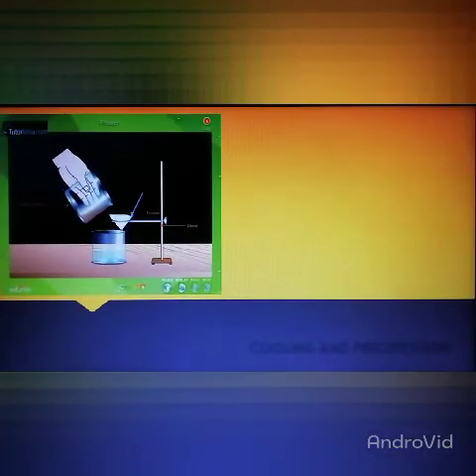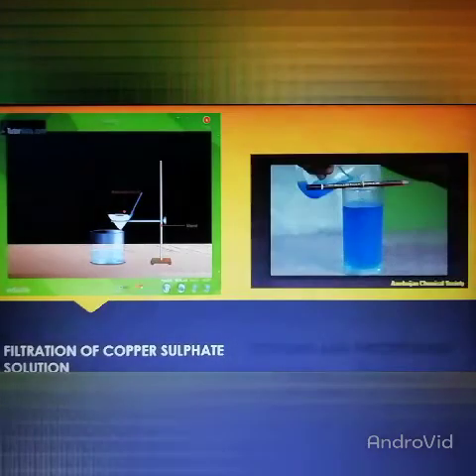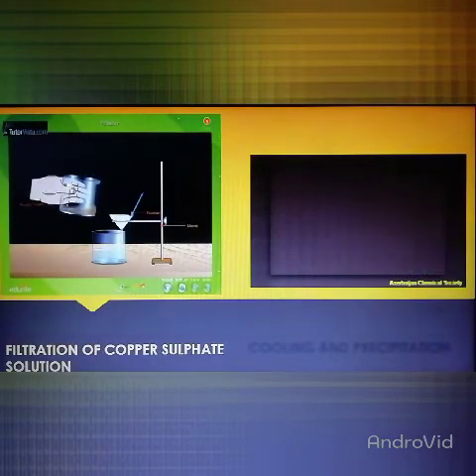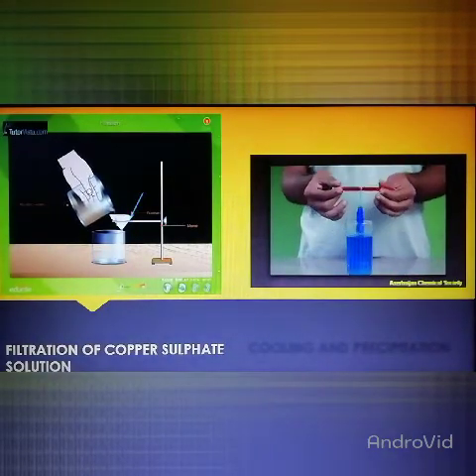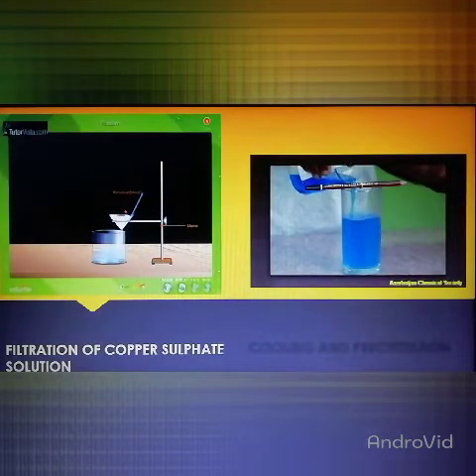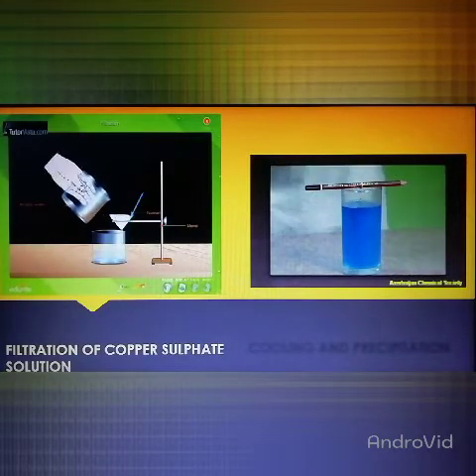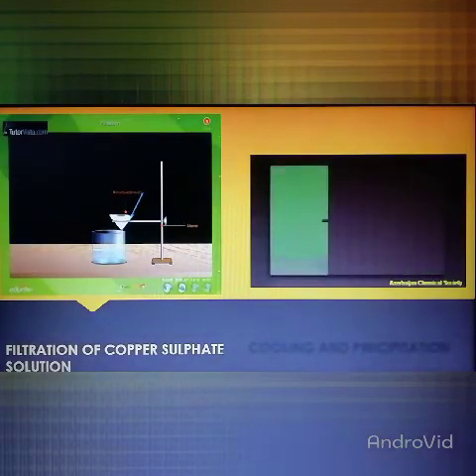Okay, and after that this saturated solution of copper sulfate is filtered, all right, and the filtrate which is collected is allowed to cool, right? Now you can see here in the image on the right, the filtrate is poured into another vessel which has a thread dangling from a pencil, right? And it is allowed to cool and left for about 24 to 30 hours.